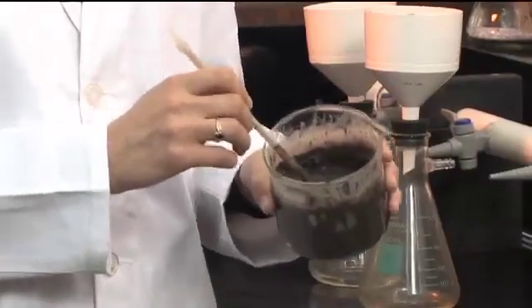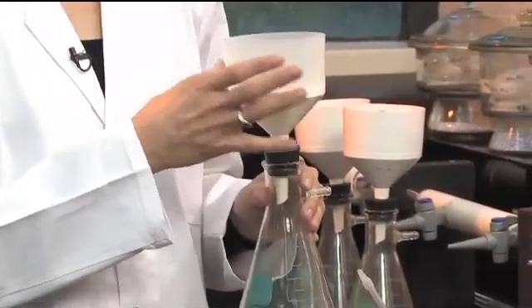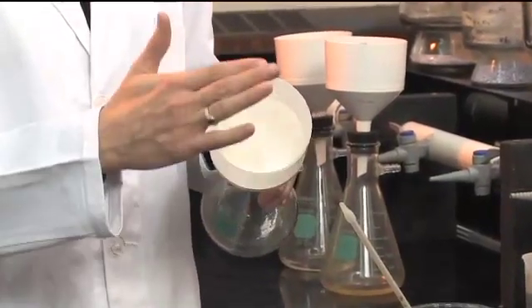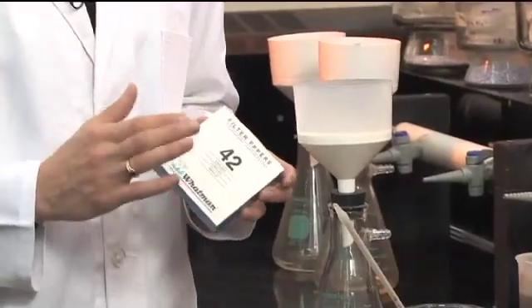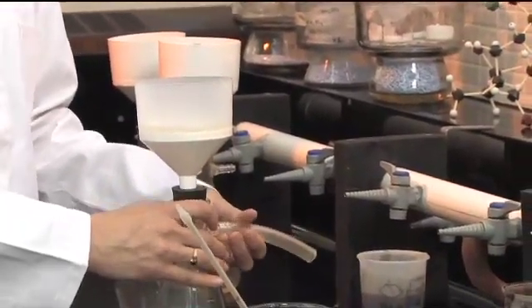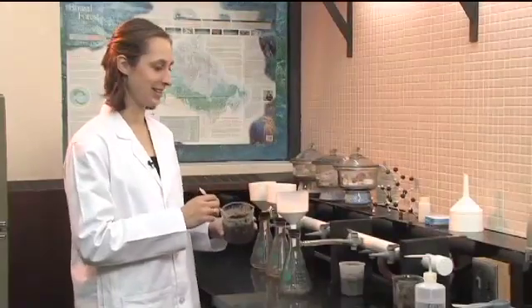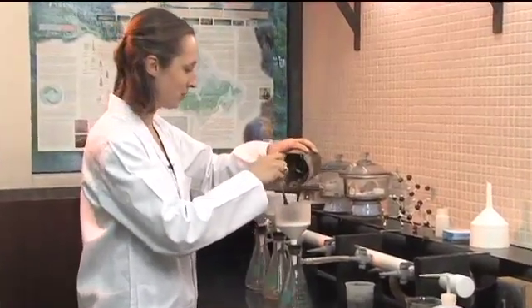After you're happy with your saturated paste, you want to get ready to filter it. Take a vacuum flask and attach a Buchner funnel of an appropriate size on top. The funnel has lots of little holes in the top, so we need to put a filter paper on there. The filter paper size we use is a Whatman number 42. Put that in the top of the funnel, then attach the vacuum flask to the vacuum apparatus and put the saturated paste into the top of the funnel.